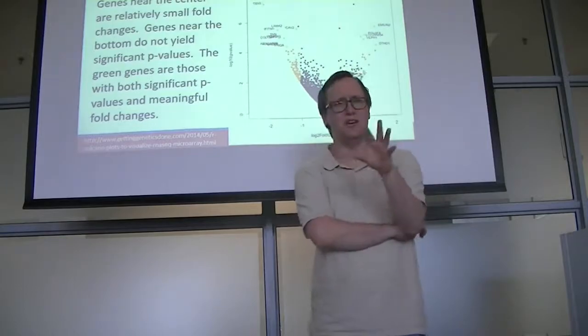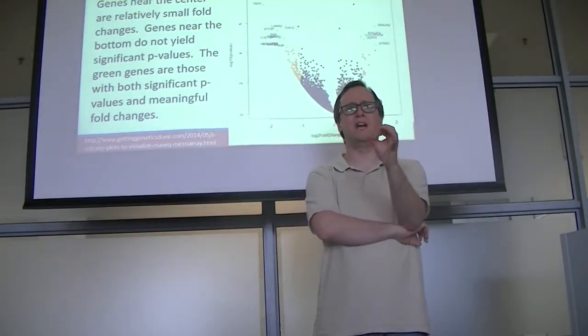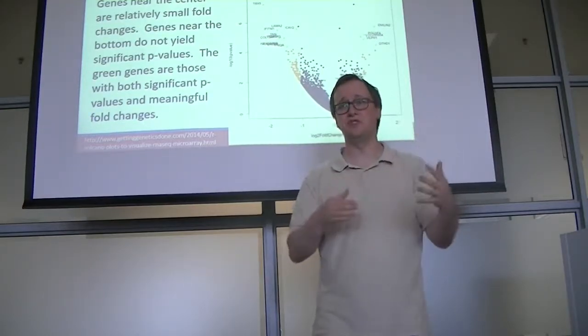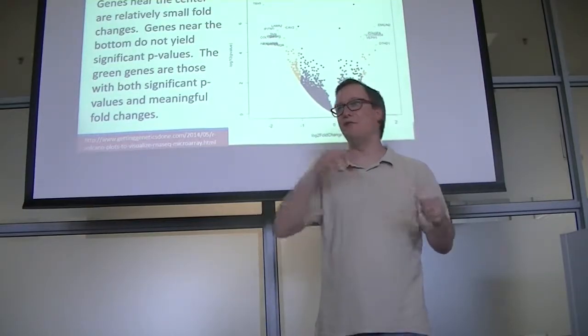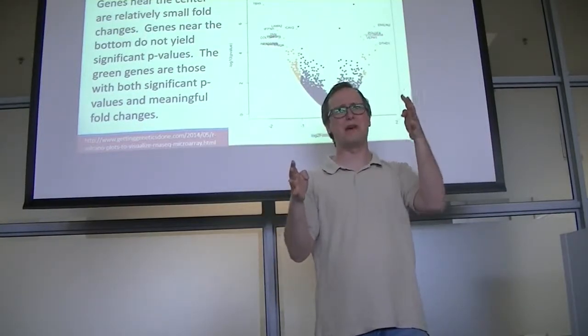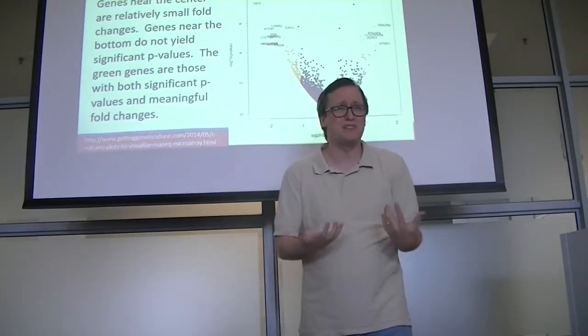Imagine that you were trying to make an argument that a certain pathway is way up under a certain circumstance. It would be embarrassing if multiple genes within that pathway had p-values, but their directions were all opposite each other, right? To have 4 genes from this pathway be way down and another 4 genes from this pathway be way up. You would need to have a little more subtlety in how you interpreted something like that.